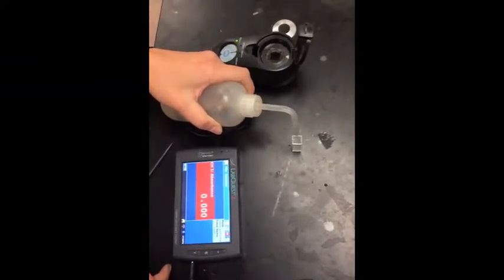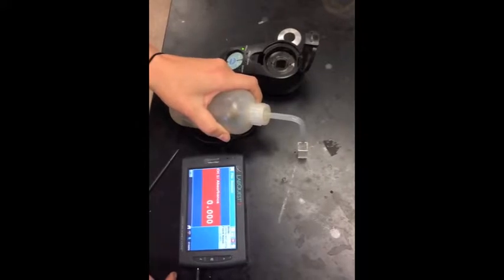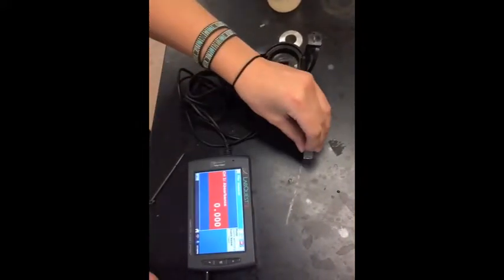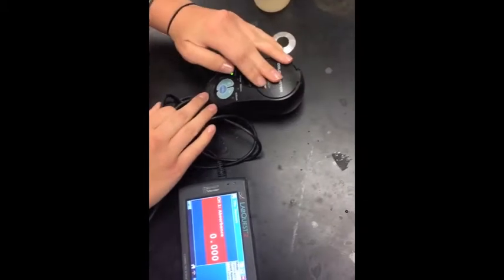For the last cuvette, fill it with three-fourths of distilled water, just like the other one. Then place the cap on it. When you put the cuvette into the colorimeter, make sure that it is facing towards the line.